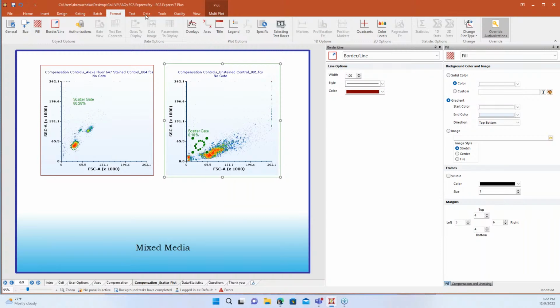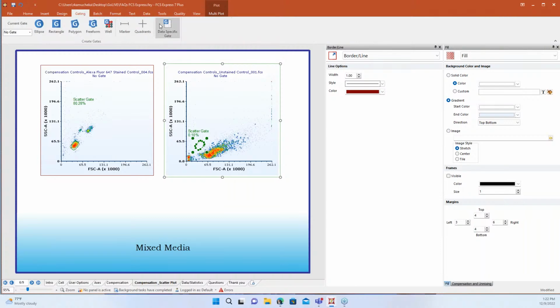Well, fortunately, you can use our data specific gate option. I like to click it because I'm very visual. Once you click it, you see this gray background, and then I can move this independently. You'll notice that my beads gate hasn't changed, but for my cells over here, I'm able to grab just my cells population. So now I'm working with the same scatter gate, and I'll still be able to use all those downstream markers that were being applied to the scatter gate itself. It gives me a little bit of flexibility so that I can do cells and beads and still get great compensation in FCS Express.